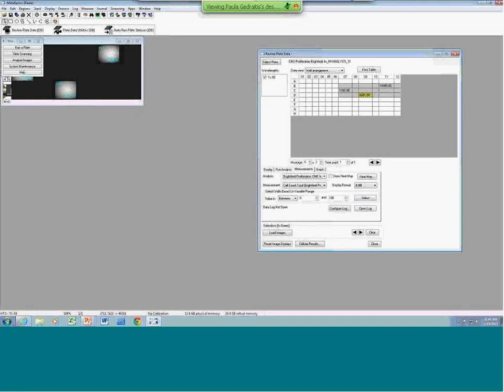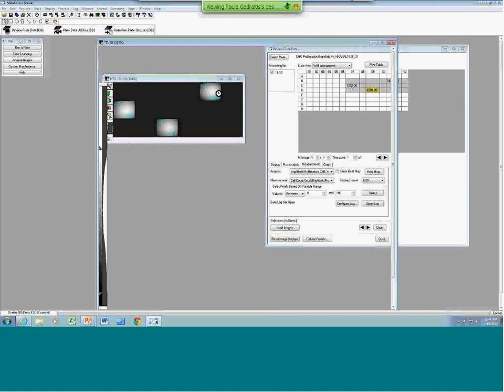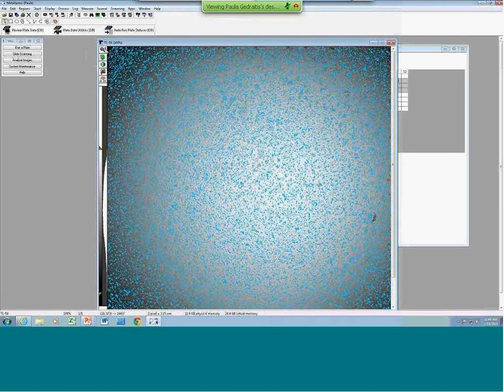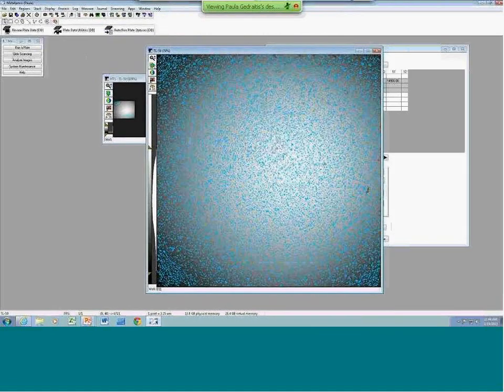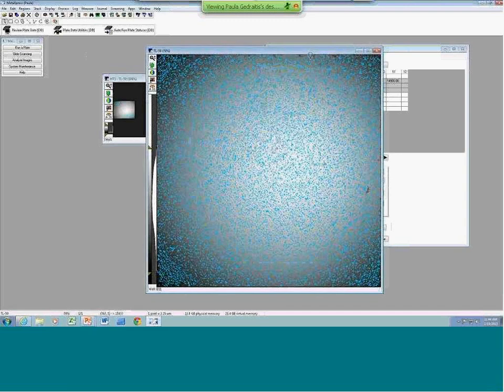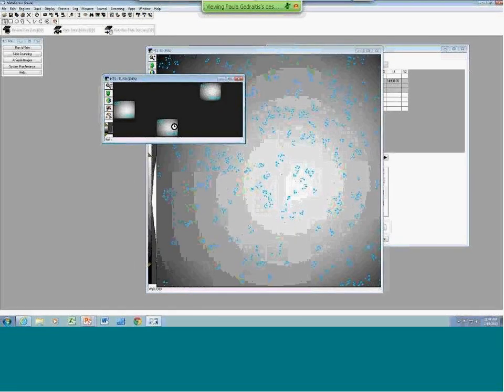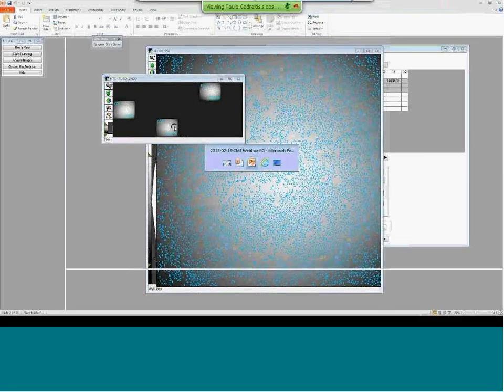My cell count total here. And if I click on any of the images, you can see the overlay. It finds cells nicely, with the shading, and it's avoiding the border objects. Okay, so it's transmitted light segmentation.